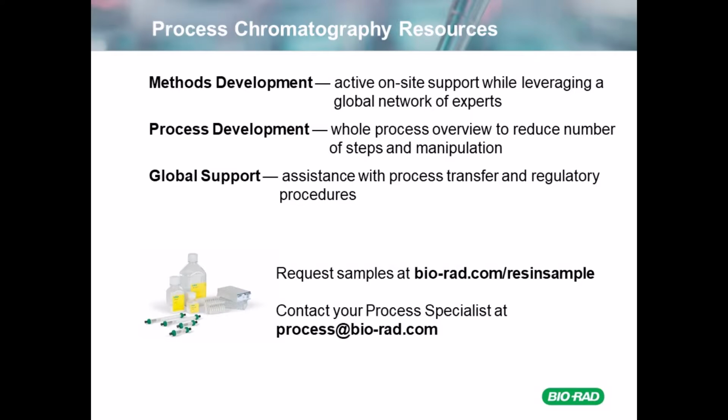Okay. And is it necessary to do preliminary testing before a viral clearance study? It isn't necessary specifically. I know a lot of places, if you've run a clearance study before, a lot of people might have an idea. If you can test before, it is useful.